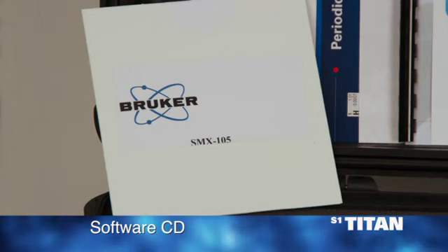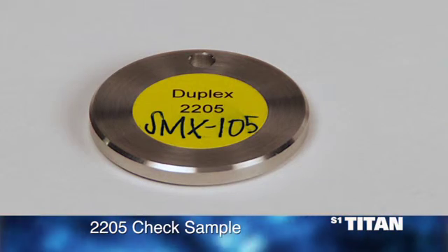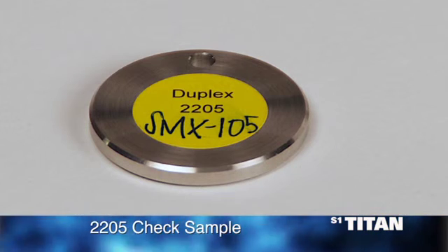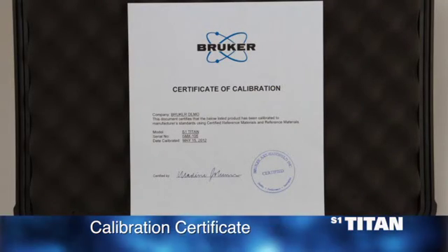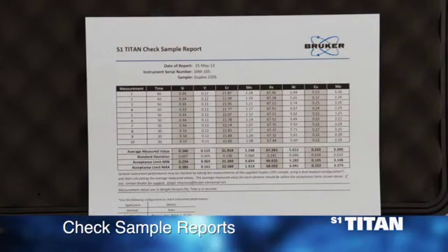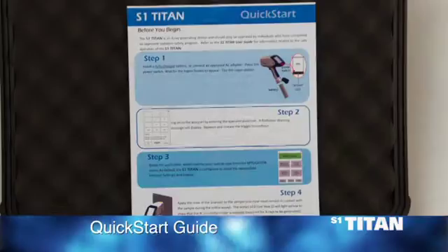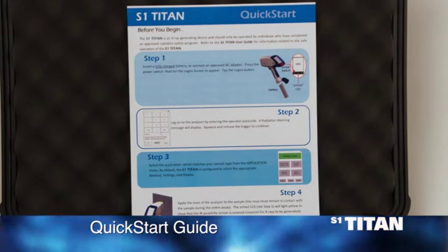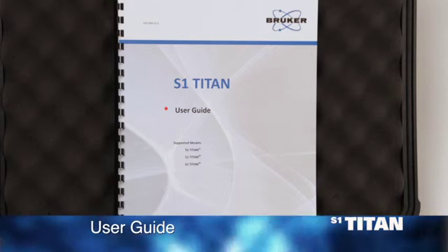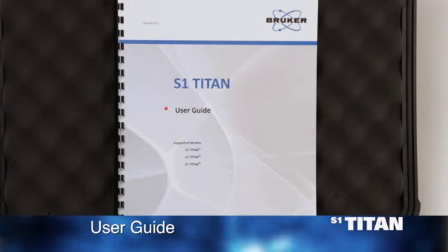A CD containing the calibration data and the files for your instrument. A 2205 check sample, which is used to confirm the calibration of the analyzer. A calibration certificate for the analyzer. A QC datasheet for the 2205 check sample provided. A quick start guide, which provides instructions for the startup of the analyzer.